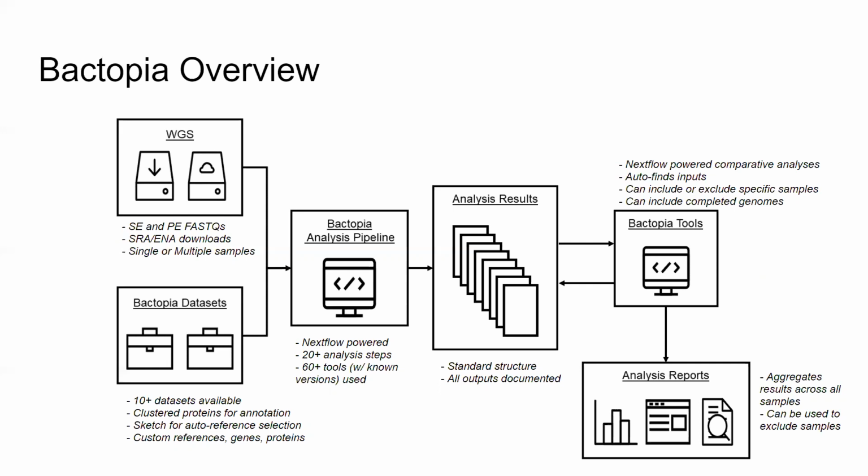Here are the programs that need to be installed. This is convenient because it tells you specifically which program version. If you use Bactopia version whatever, you can go on the GitHub repo and see that at that version it was using these program versions. But I also created a Bactopia versions tool, which will spit out what program versions are used in Bactopia at that point in time.